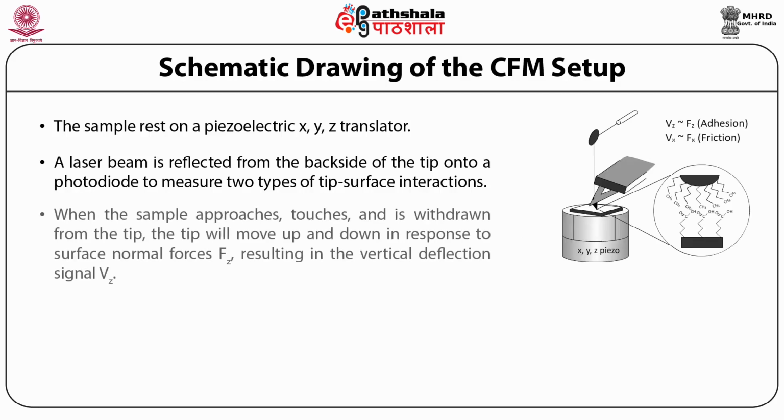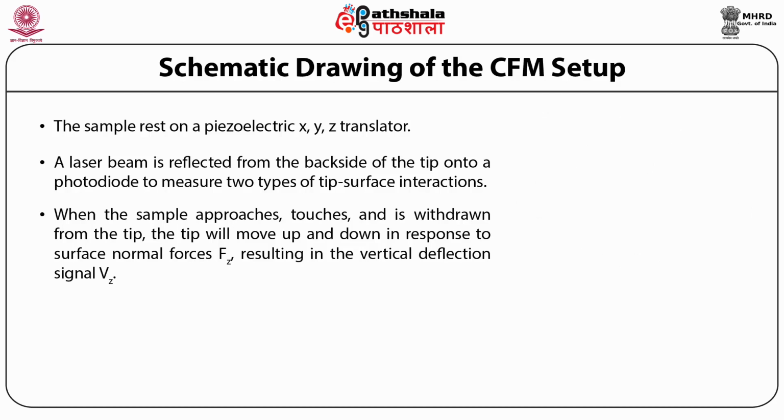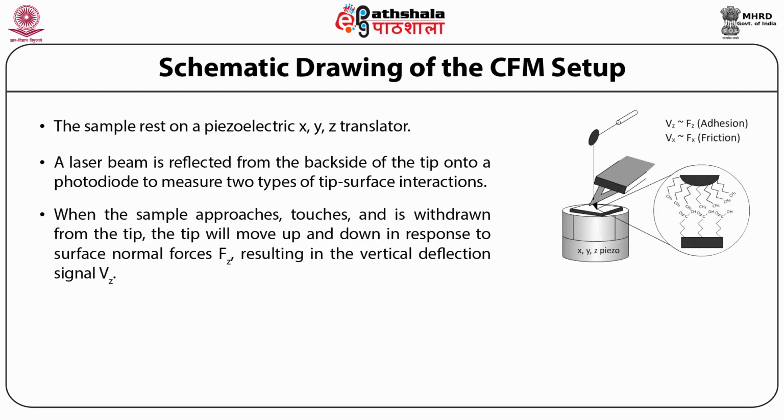interaction. When the sample approaches, touches, and is withdrawn from the tip, the tip will move up and down in response to surface normal forces Fz, resulting in the vertical deflection signal Vz.